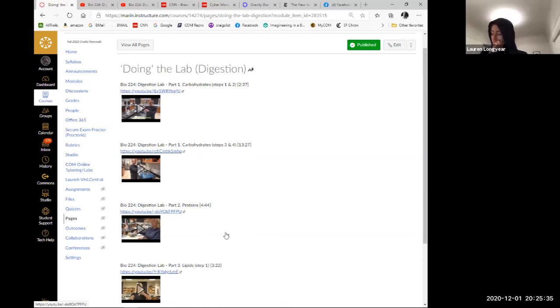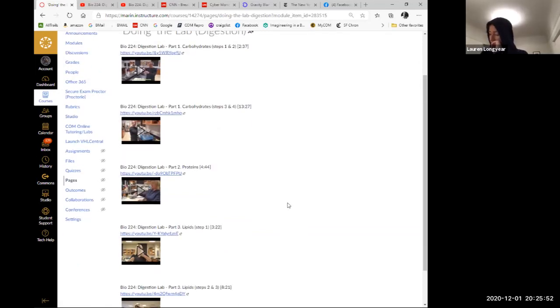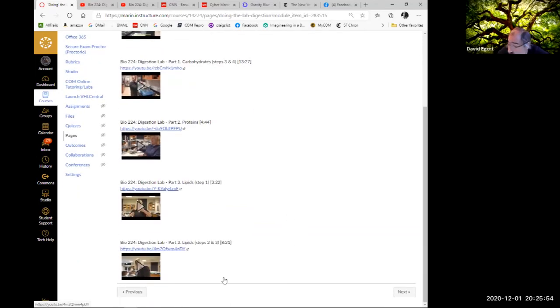Thank you. Yeah, so the thing you're looking for is the color. You don't really care about the clarity. The clarity is going to be messed up because of the spit. But the color is the thing you really want to pay attention to. Yes. Sure. So, all right, let's see, what time is it? Let's do the lipids.